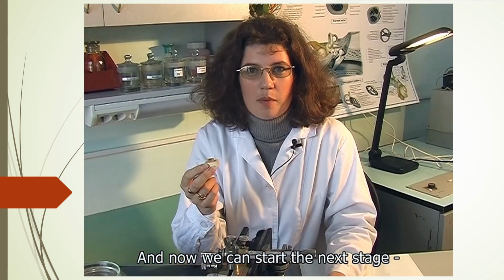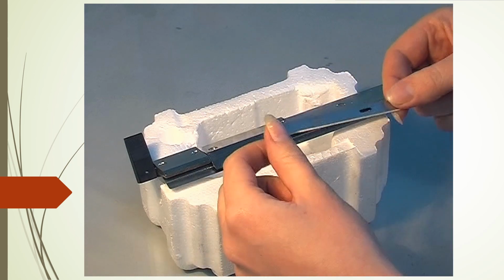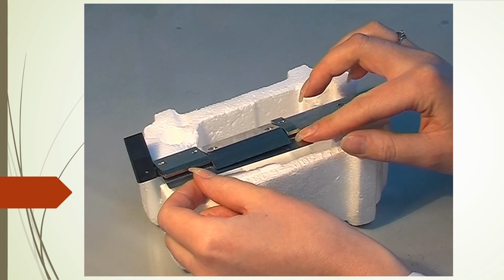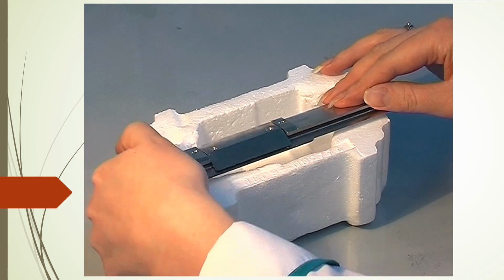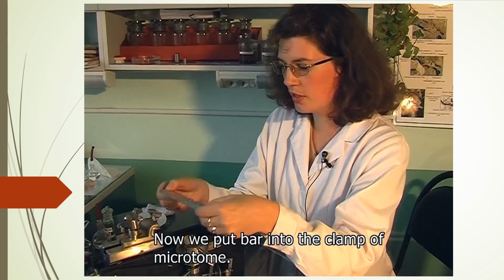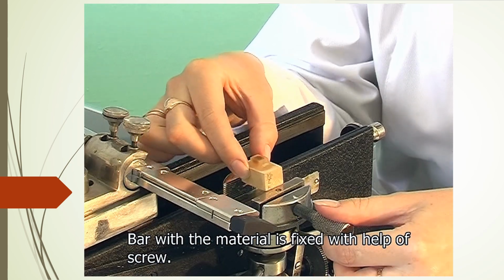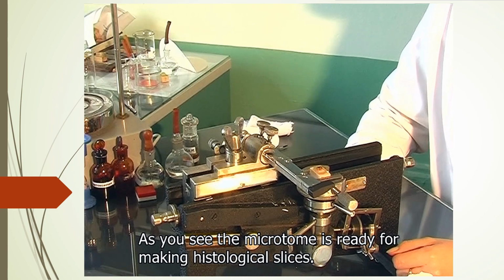And now we can start the next stage, making histological slices. These are changeable disposable knife blades which we place in the adapter holder and fasten. Now we put the bar into the block holder of the microtome. The bar with the material is fixed with the help of a screw. As you see, the microtome is ready for making histological slices.